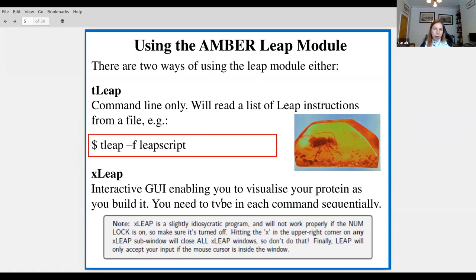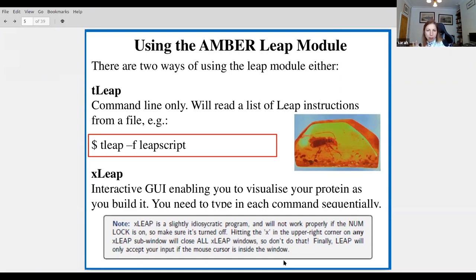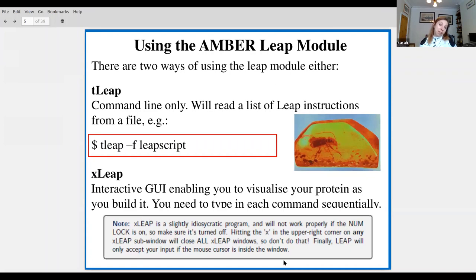A few quirks to x-leap: don't have numlock on, and whatever you do, always use the menus to close LEAP or any other windows you might open. If you close one window it closes everything, which has led to some bad language in workshops before. Be very, very careful closing LEAP.